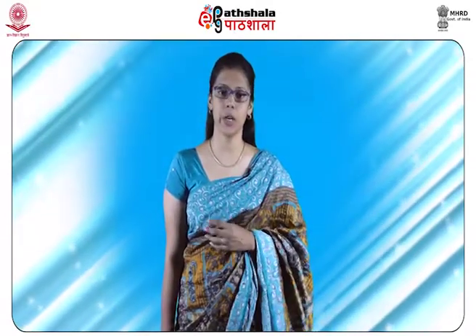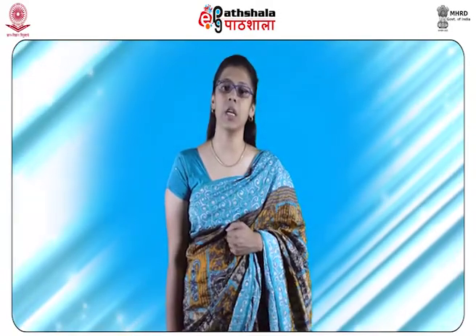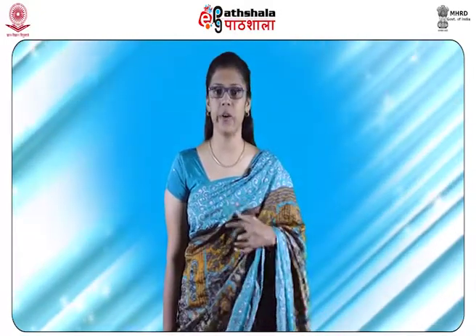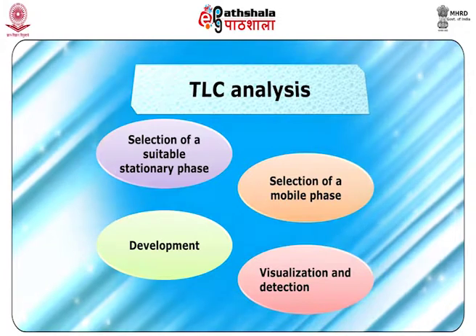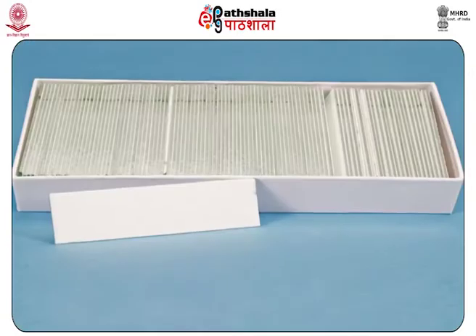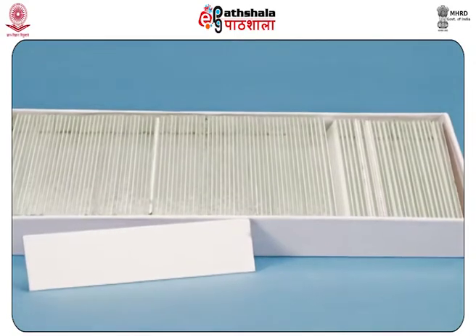First, thin layer chromatography. For 25 years in forensic science, TLC, that is thin layer chromatography, has been used for comparison of control and questioned fibers. The most important advantage of this technique is its ease as contrasted to different chromatographic techniques. The analysis involves first the selection of a suitable stationary phase, selection of mobile phase, development, and then visualization and detection. For the analysis of dye fiber, an aluminium backed silica plate is recommended.